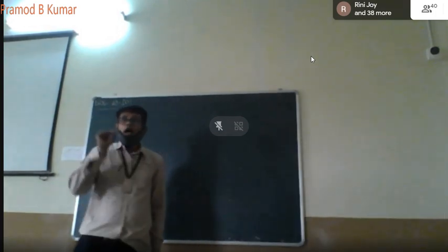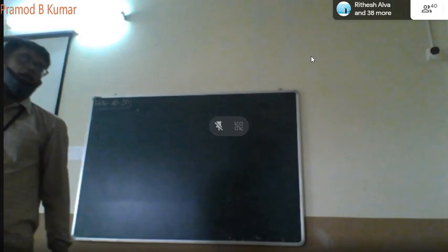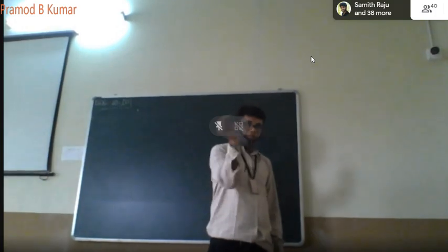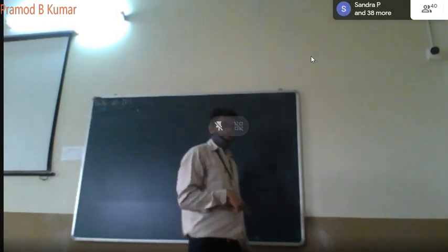It is the alkaline oxidation of your benzyl chloride to the acid using KMnO4. Let's make a note, everybody: KMnO4 is an oxidizing agent.